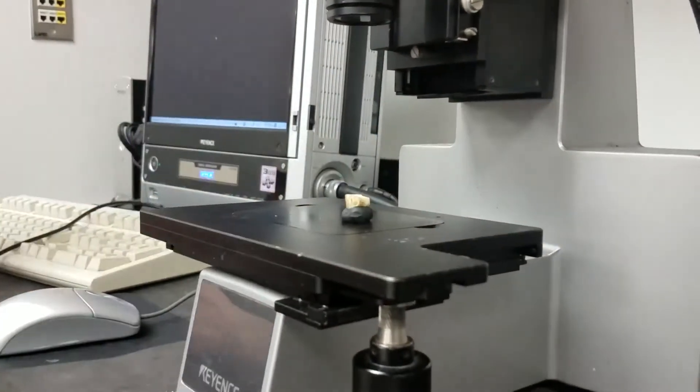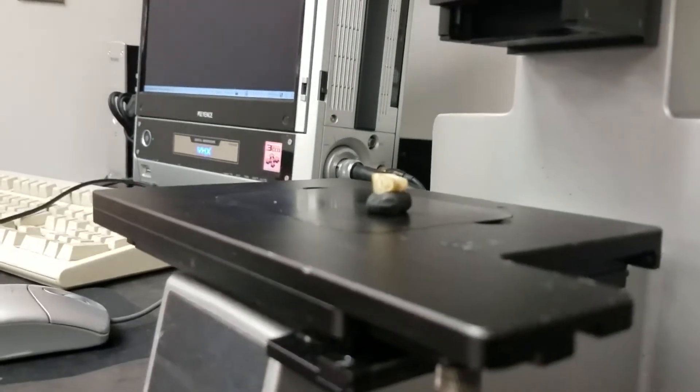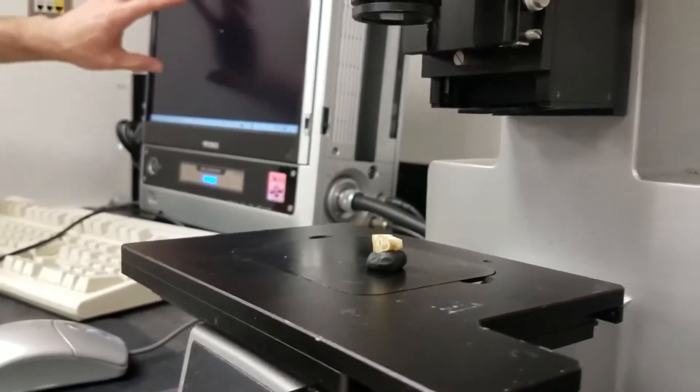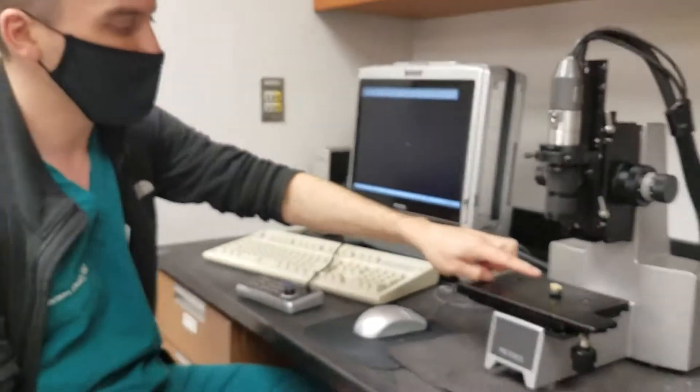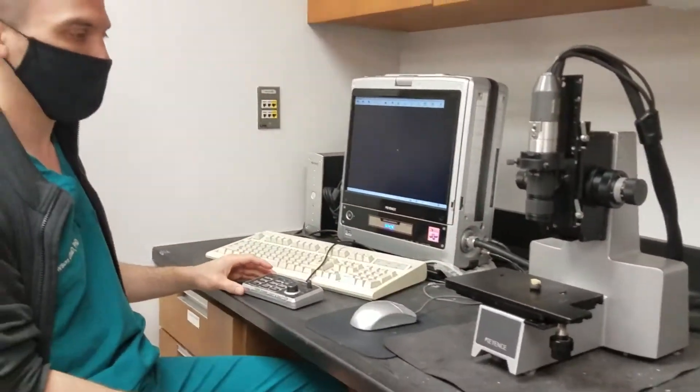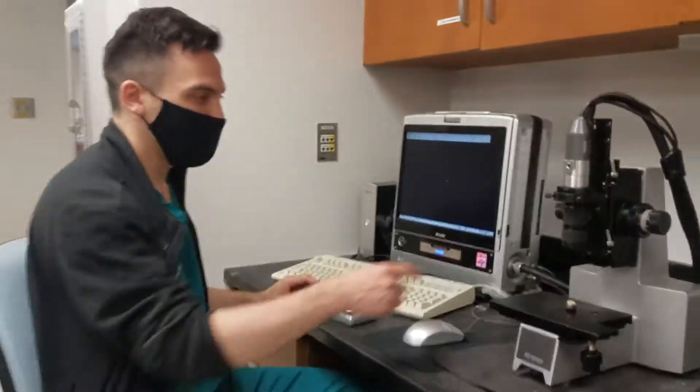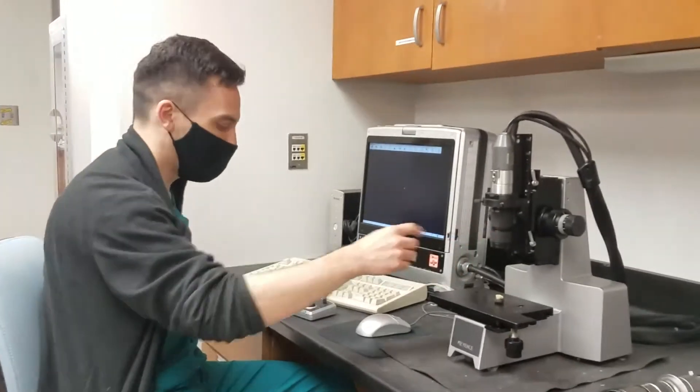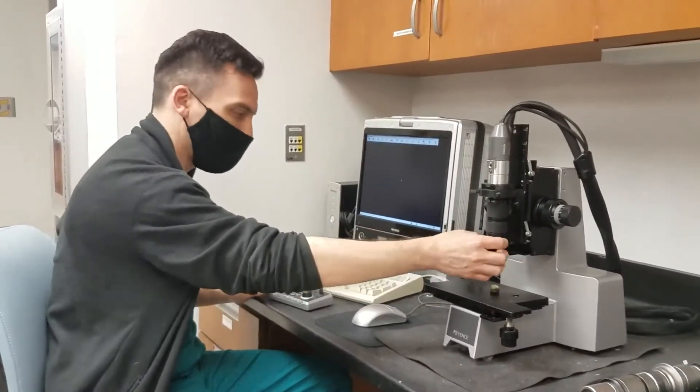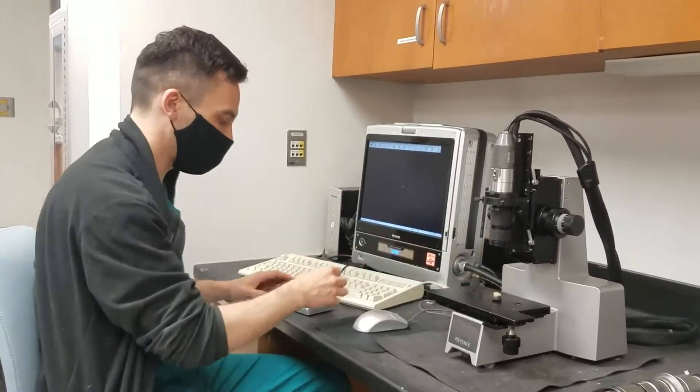When the machine first starts to boot up, as you'll see on the screen here, it just looks very dark. So in order to see your object, you're going to have to do two things. You have to turn on the light, and then you also have to open up the shutter inside of the lens here.